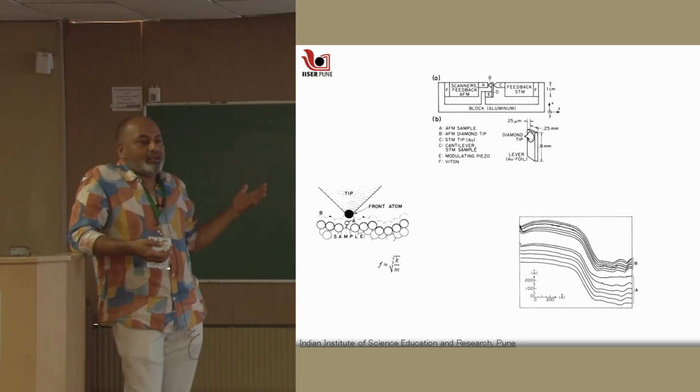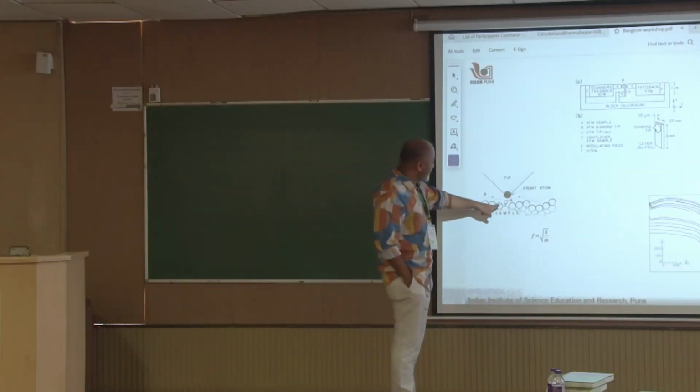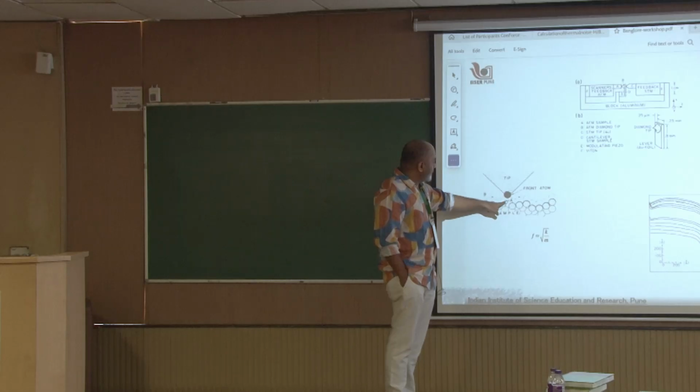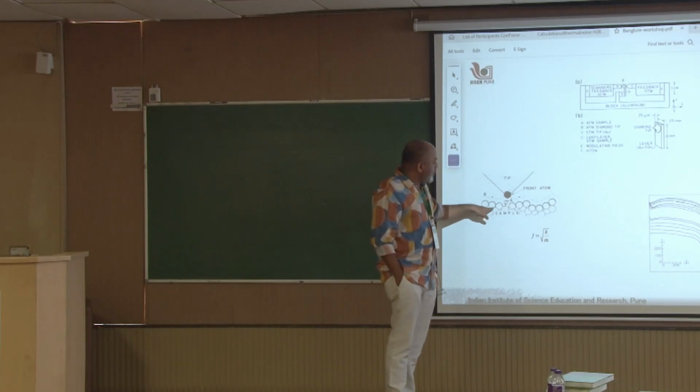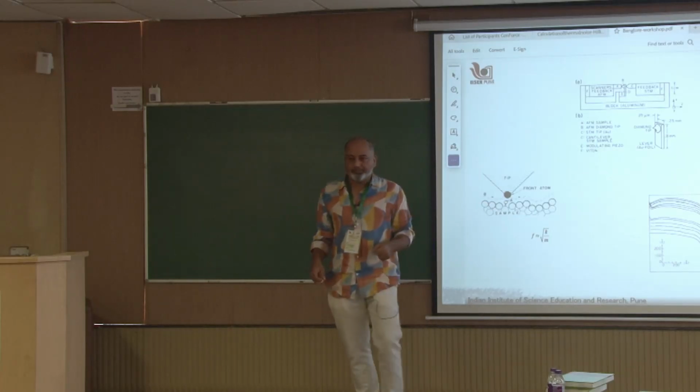And if you look into the history, they were questioned a lot by the community as to whether this is then shown also with a nice picture here. If I have to bring a tip atom close to the surface, the atom is bound to the whole thing, yes, fine, but then this binding also is depicted by a spring here, you see.